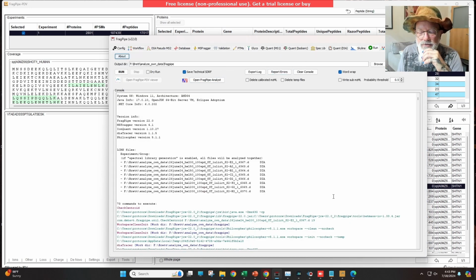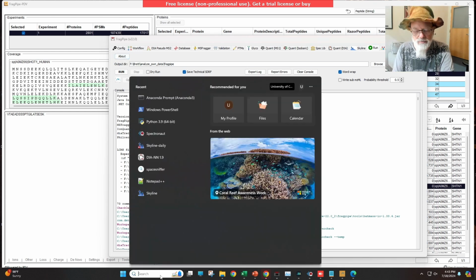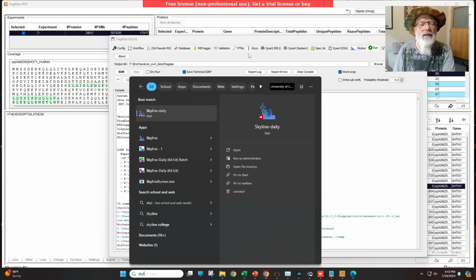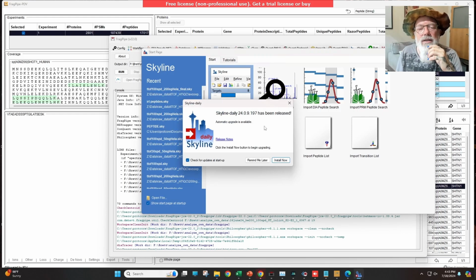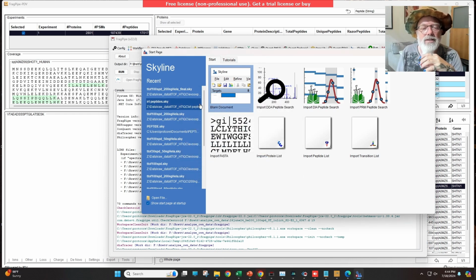And what we do is we go and open Skyline daily, which we installed last time, remember? And there's an upgrade, or an update, because it is a daily thing. But just remind me later. Okay, so we're gonna want to open it.